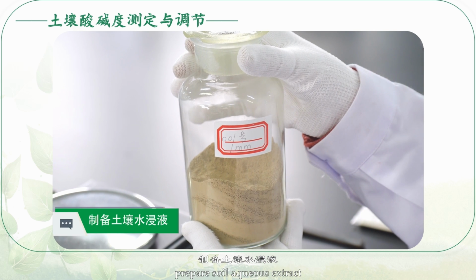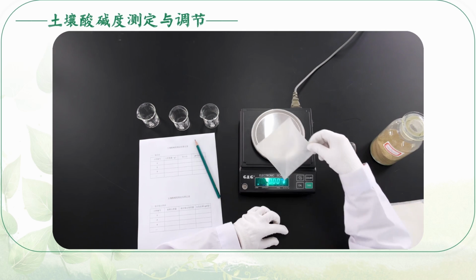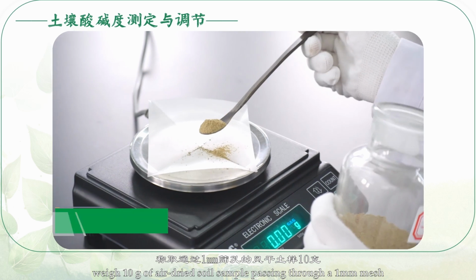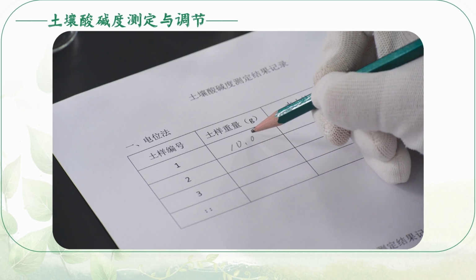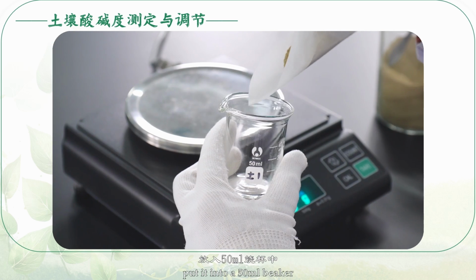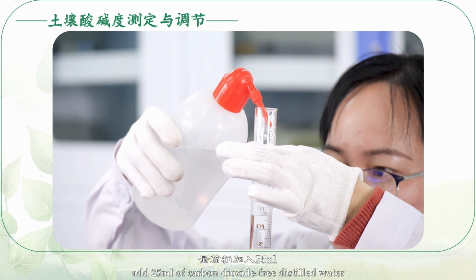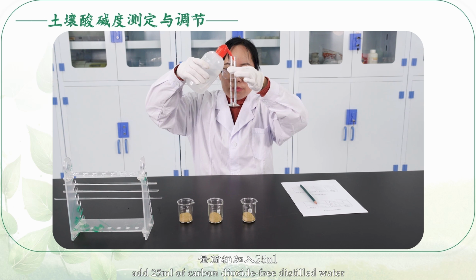First, prepare soil aqueous extract. Weigh 10 grams of air-dried soil sample passing through a 1 mm mesh. Put it into a 50 ml beaker. Add 25 ml of carbon dioxide-free distilled water.